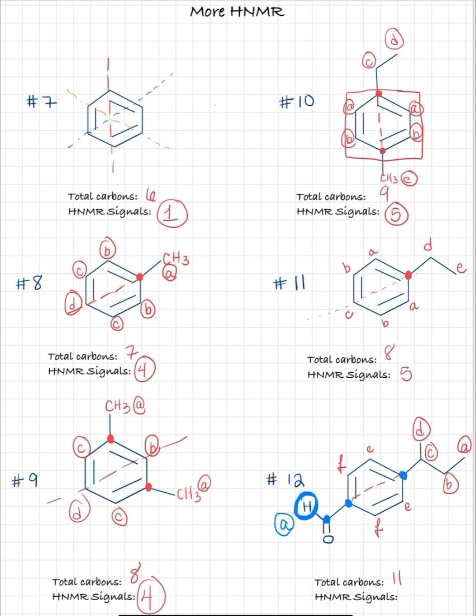F. Oops, so sorry. I already labeled my A, y'all. Why didn't no one tell me? You're like, girl, we letting you do your thing. You the teacher. I mean, yeah, but I'm also human and I make mistakes. So let's go back through that. I forgot I had labeled it. A in blue is my problem. So there's your A. Now we're going to continue. B, C, D, E, F.